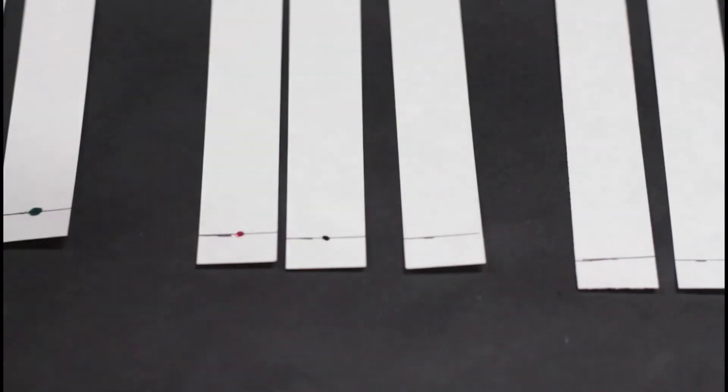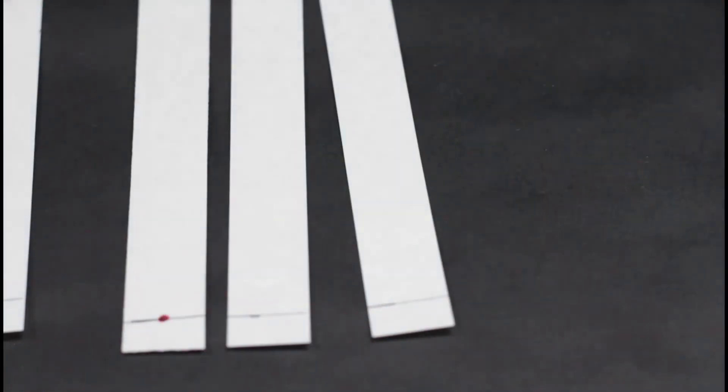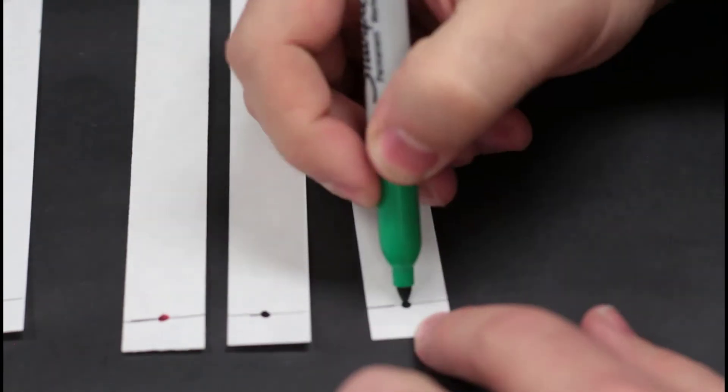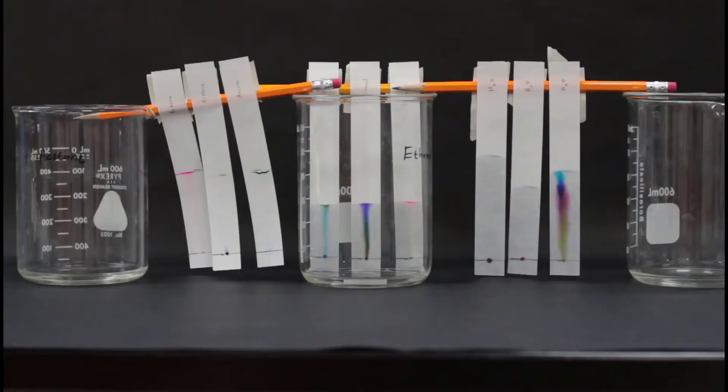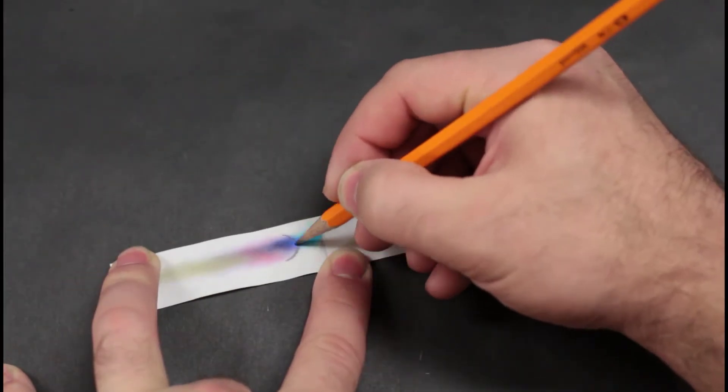In this lab, we will be learning a separation technique called chromatography. Chromatography separates different substances based on how attracted they are to different solvents. That attraction is based on polarity.